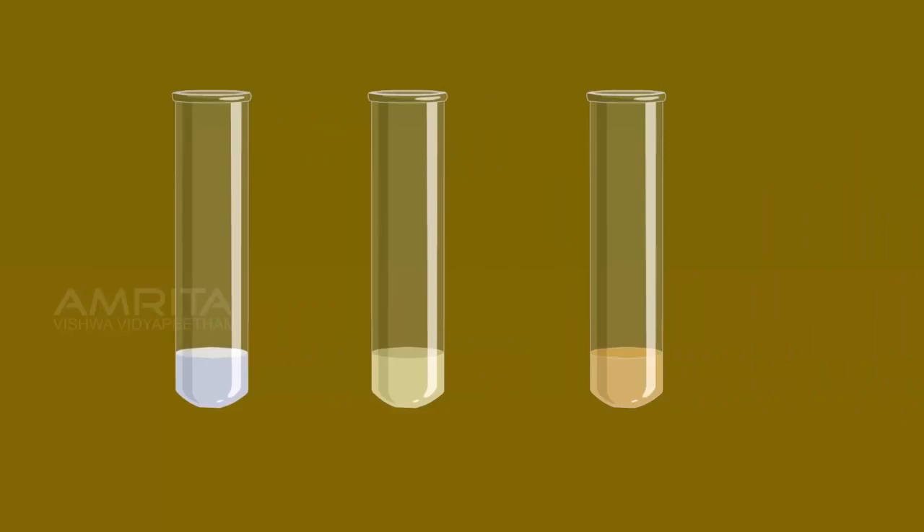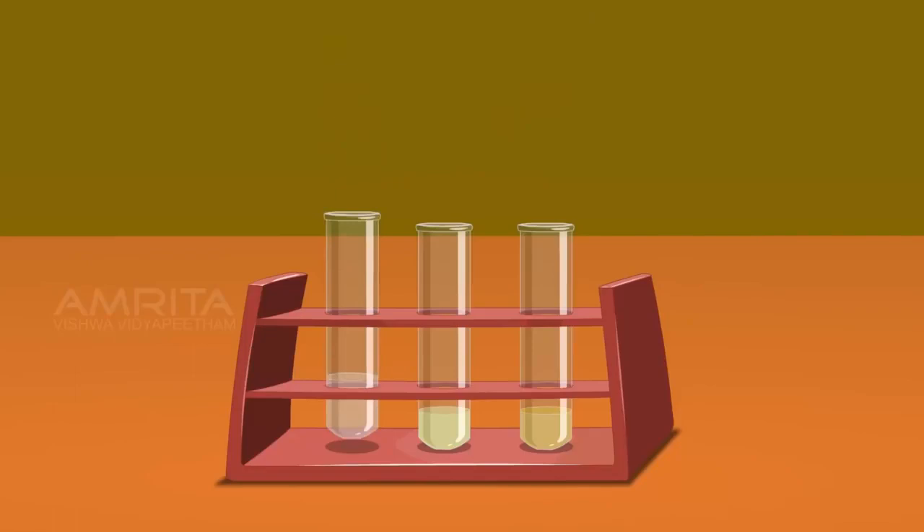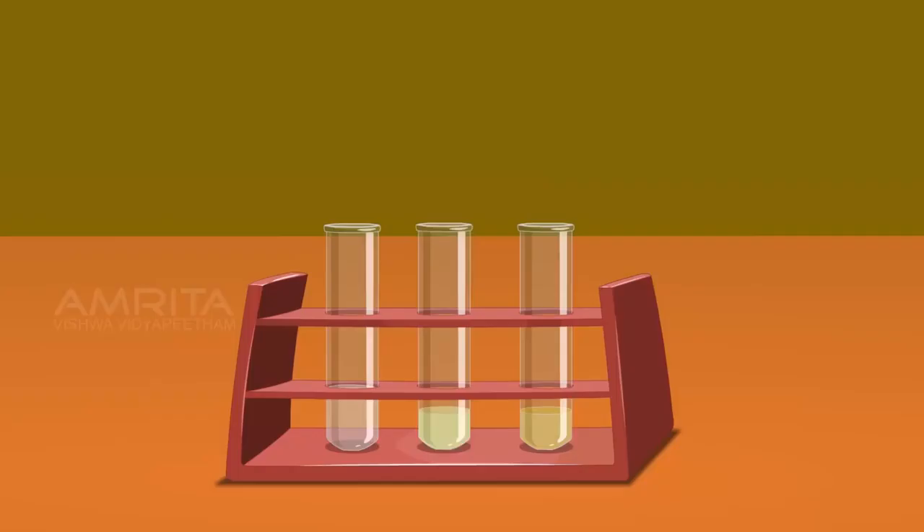Take ammonium hydroxide solution using another dropper. Take the test tube containing the white precipitate of silver chloride and add excess ammonium hydroxide into it, then shake the test tube well. Silver chloride is soluble in excess ammonium hydroxide due to the formation of a soluble silver complex. Similarly, take the test tube containing the pale yellow precipitate of silver bromide, add excess ammonium hydroxide and shake well. Silver bromide is sparingly soluble in excess ammonium hydroxide.